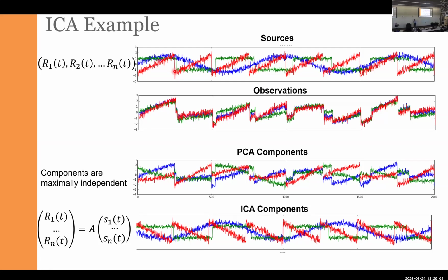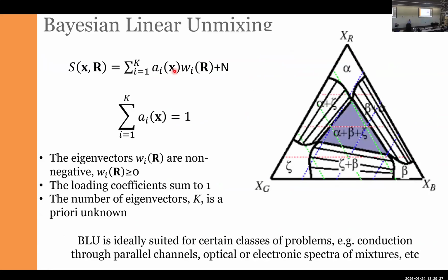I expect that ICA would be super useful once we analyze data which is the sum of multiple sensors streaming in time. So if we have the data as a function of time detected from multiple detectors, it would be useful. Anything related to dynamic data, parallel detection, and so on can be super useful. But again, I haven't seen an example of it happening so far.